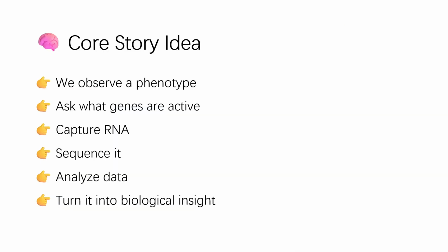Transcriptomics is like listening to the cell's conversation. Phenotype is what we see. Transcriptome is what the cell is saying. And RNA-seq is the technology that lets us hear it. From observation, to molecules, to data, to understanding. That's the journey of modern biology.